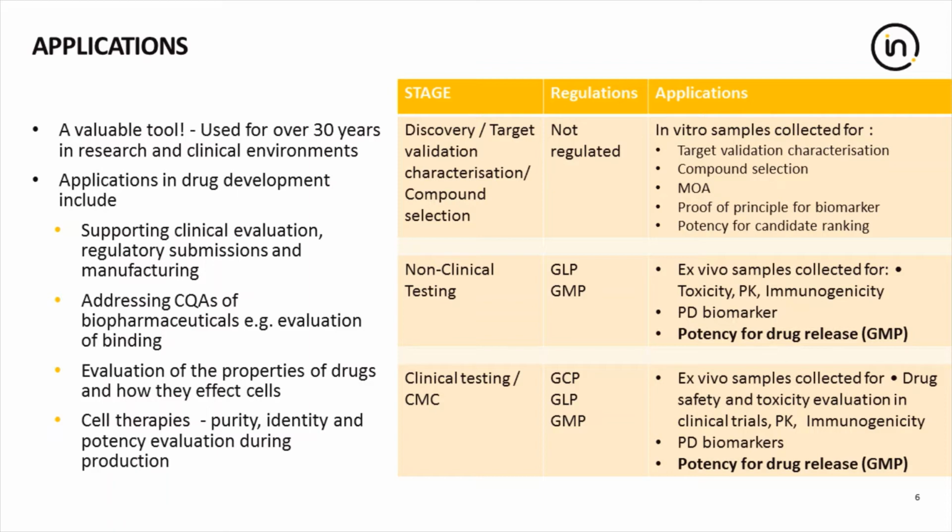The drug development stage will determine if any regulatory standard is required. The different stages also have different requirements in terms of what applications you might want to consider using the flow cytometry for.